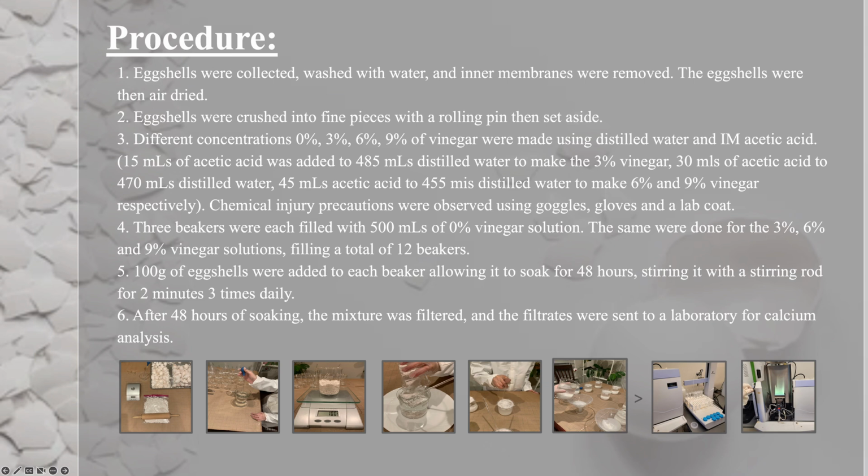Different concentrations, 0%, 3%, 6%, and 9% of vinegar were made using distilled water and acetic acid. Three beakers were each filled with 500 milliliters of 0% vinegar solution. The same was done for the 3%, 6%, and 9% vinegar solutions, filling a total of 12 beakers.